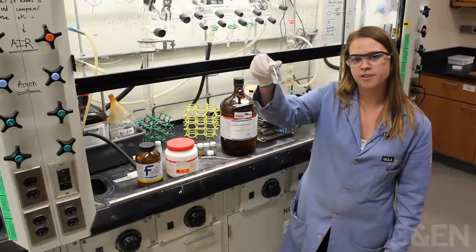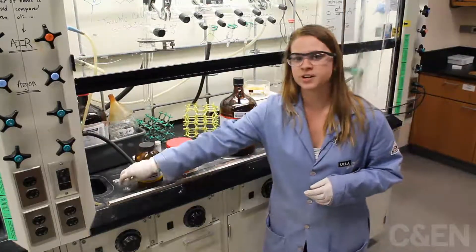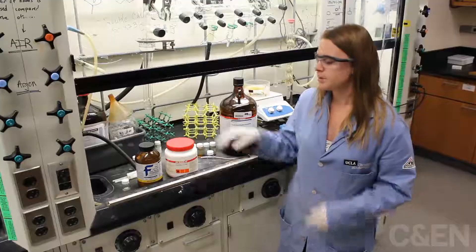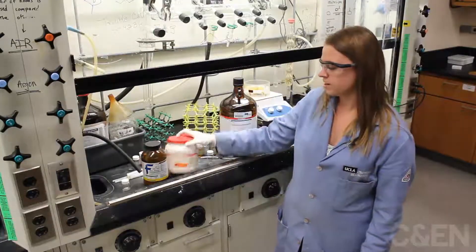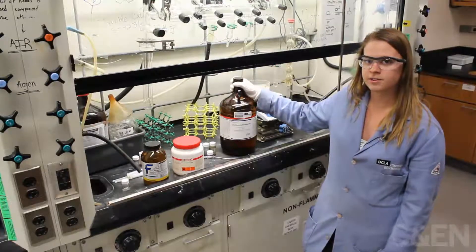Here are some crystals of MOF-5, the first metal organic framework that was synthesized. It's made from mixing zinc with terephthalic acid and a solvent such as DMF or DEF in a vial.